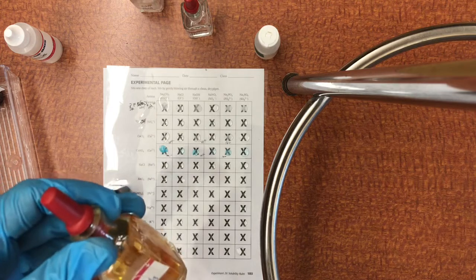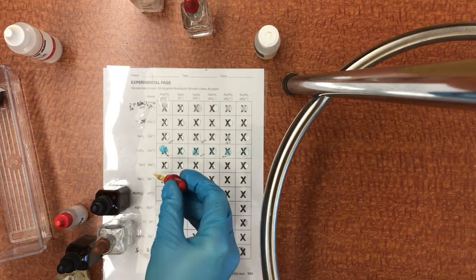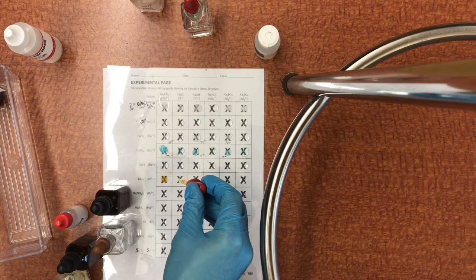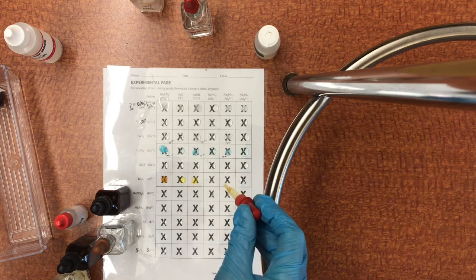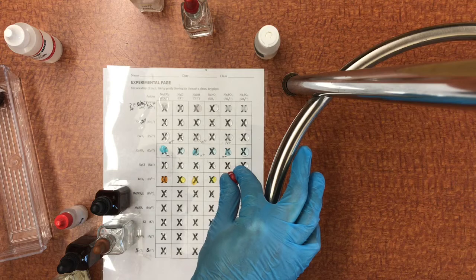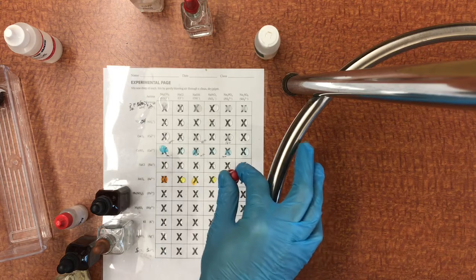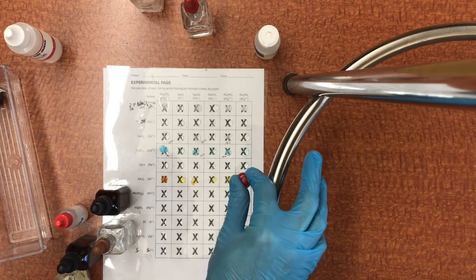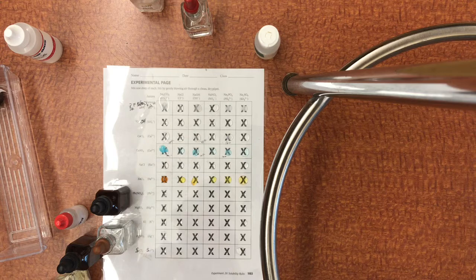This is the iron chloride. It's yellow in color, and that's because of the interaction between the iron and the waters. So there is a nice distinct solid forming. That one is no reaction. That one is some reaction. No reaction. Oops, that's just an air bubble. Let's try that one more time. That one's hard to say, and let's try the sulfate. Sulfate looks like no reaction to me.